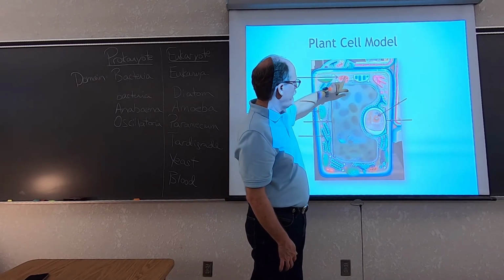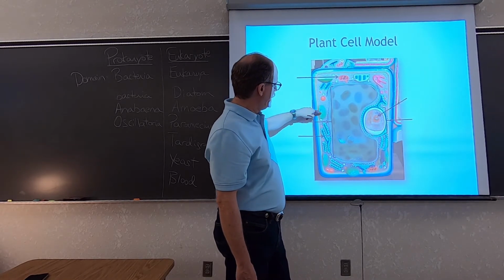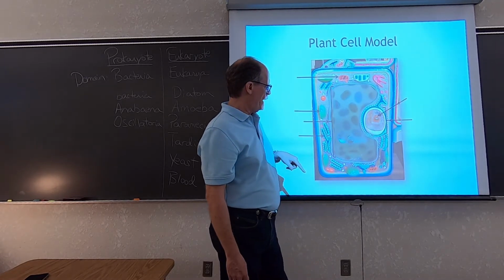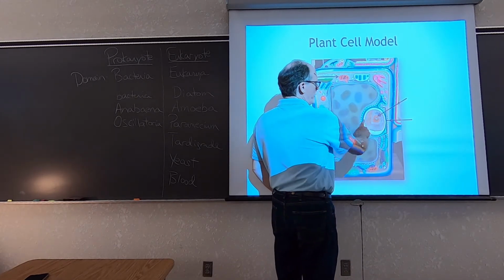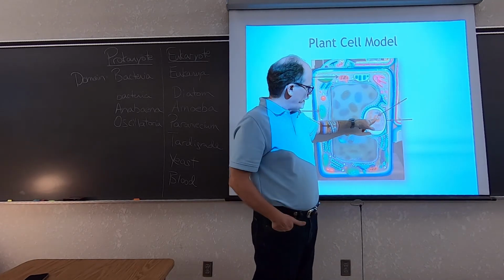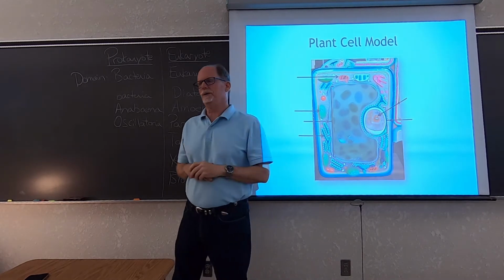This is a mitochondria, the orange guys. And the green disc, this is a green disc cut open. That's a chloroplast, right? All these green are chloroplasts. And then this whole oval is a nucleus, and the center thing here is called the nucleolus, which is a structure inside the nucleus.